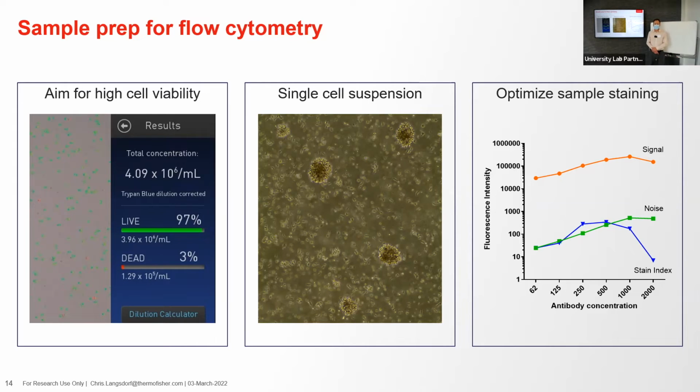Sure. Yeah, and it depends on the model. DNase is great because as cells die and the DNA spills out, it just kind of ties all the cells together. Yeah, and you can often see it looks kind of like shampoo or something in the vial. And so DNase is helpful.